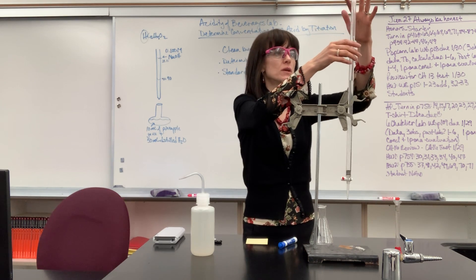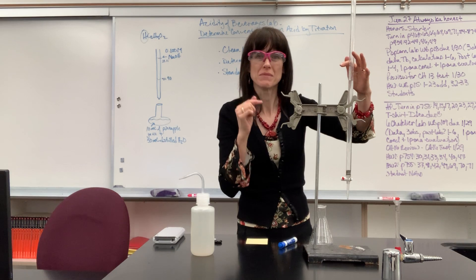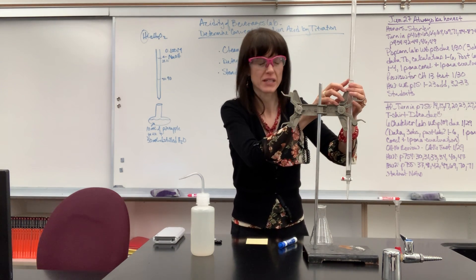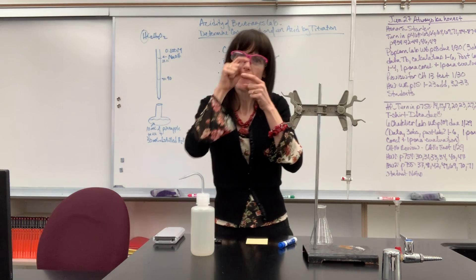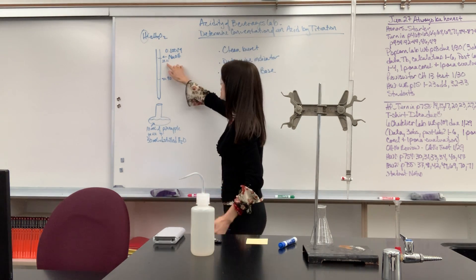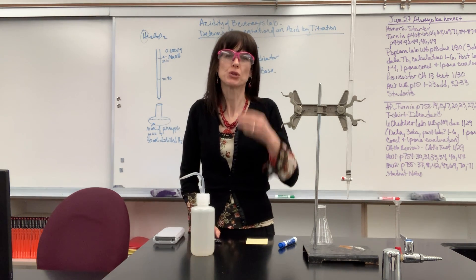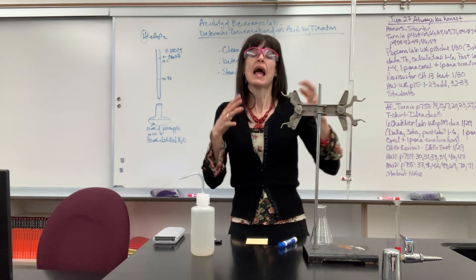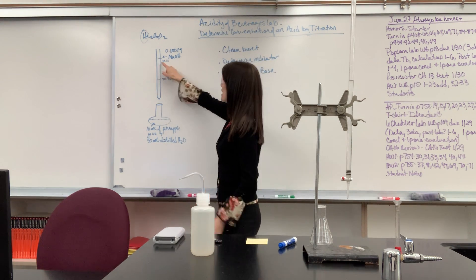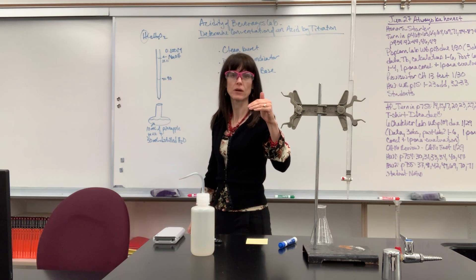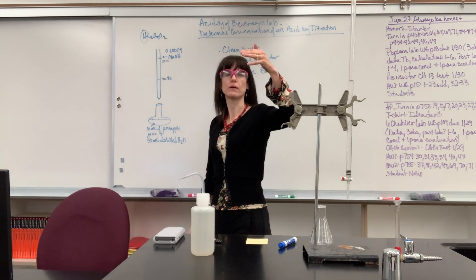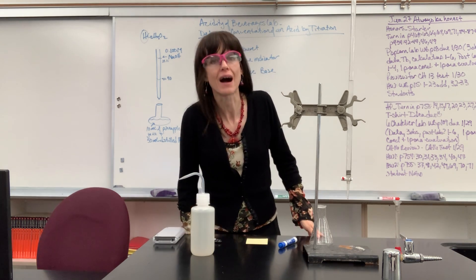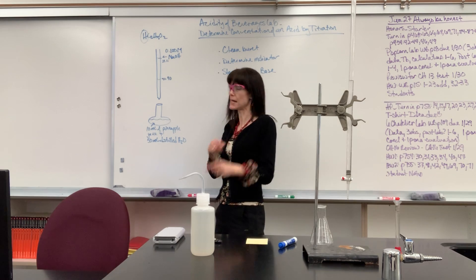Let me show you how I read this. So I actually start at zero, and I go, okay, this is going to be one, two, three, four. You're literally reading the number where the meniscus hits. So I'm going 20, 21, 22. Okay, I'm at 28, and then it goes by the tenths place. So then I go 28.1, and I look close, and the meniscus is exactly hitting 28.1. Now, you'll recall when we're doing significant figures, you always write down what you know with certainty plus one guess. Well, with certainty, we can go to the tenths place, which means I have to make a guess at the hundredths place. To me, it looks like that meniscus is dead on that line, the point one, so my guess is zero. Now, if it was a little bit lower, if it was 28, then 28.1, and a hair lower, then I might guess like 28.15. The .05 would have been my guess, but I think it's dead on.